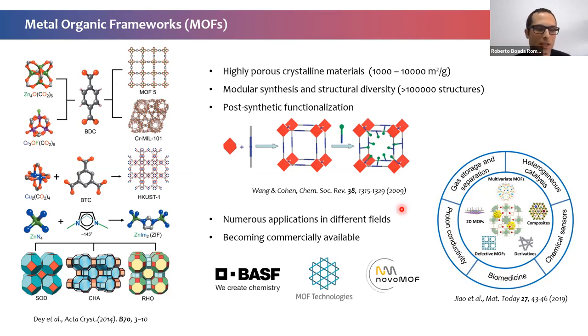And one of the things that is becoming more beneficial nowadays is that for practical applications that require a large scale of materials, some of these frameworks are becoming commercially available. There are different companies. The one we are going to be reporting today was bought from Sigma-Aldrich, and it's synthesized by BASF. It's a good opportunity to go beyond the synthesis and characterization, and into practical applications.